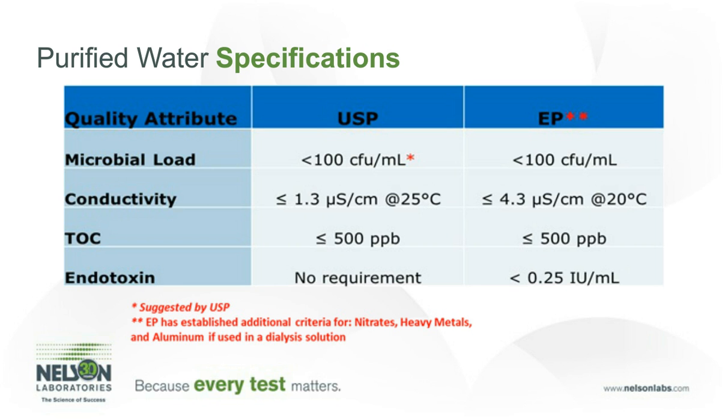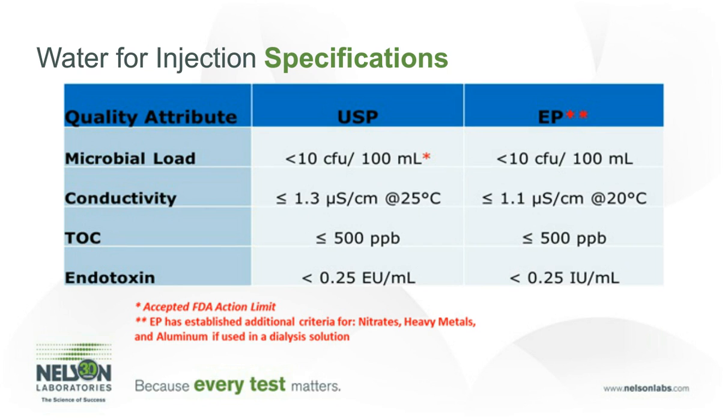Looking at water for injection specifications, again, they're fairly harmonized. Again, the microbial loading is implied at less than 10 CFU per 100 mL. And again, the rest of the critical quality attributes, conductivity, TOC, and endotoxin, are harmonized fairly well between the two agencies.